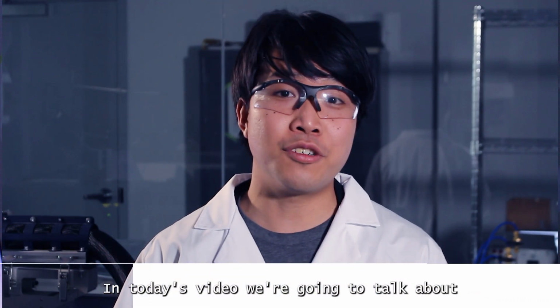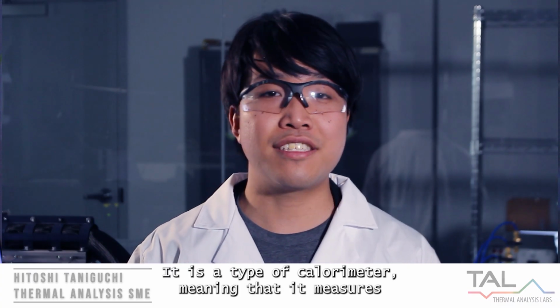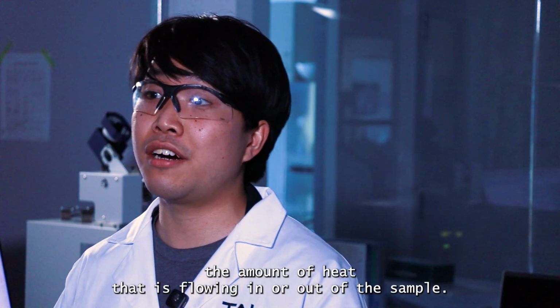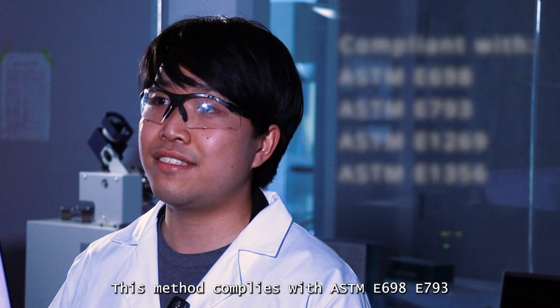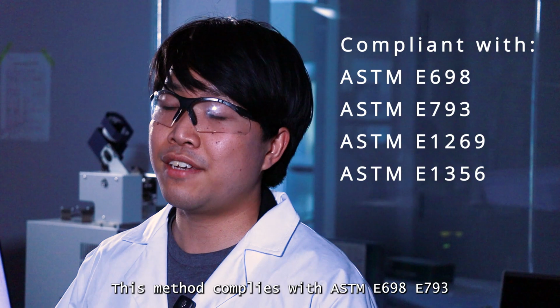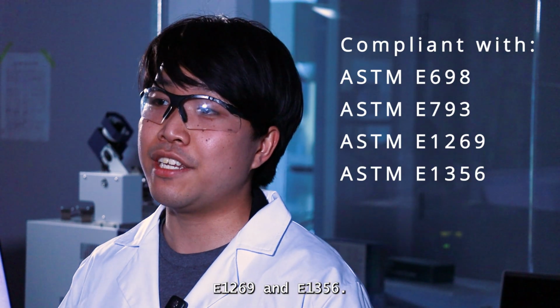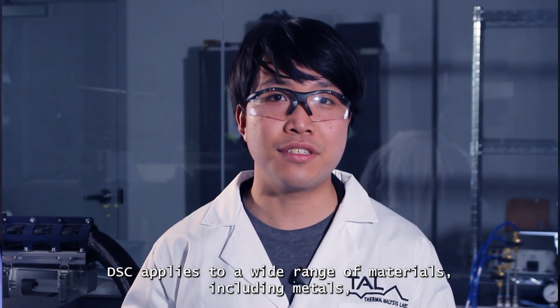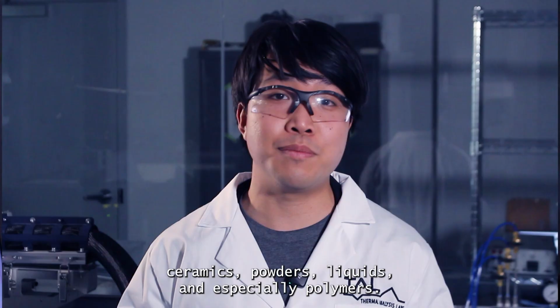In today's video, we're going to talk about a Differential Scanning Calorimeter, or DSC. It is a type of calorimeter, meaning that it measures the amount of heat that is flowing in or out of the sample. This method complies with ASTM E698, E793, E1269, and E1356. DSC applies to a wide range of materials, including metals, ceramics, powders, liquids, and especially polymers.